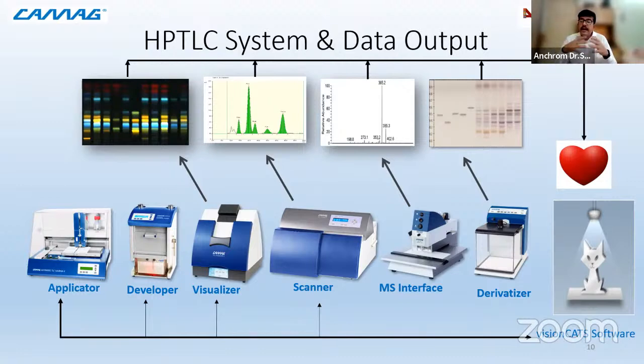So preliminarily, when I have 100 things to screen and I have no understanding of what they are, I can explore these derivatizing reagents and find out whether it is a coumarin, a bitter principle, and things like that. So this can be a real game changer for understanding what I'm searching for. This derivatization also increases your sensitivity, and it can reduce your LOD and LOQ values, which are critical for quantification.